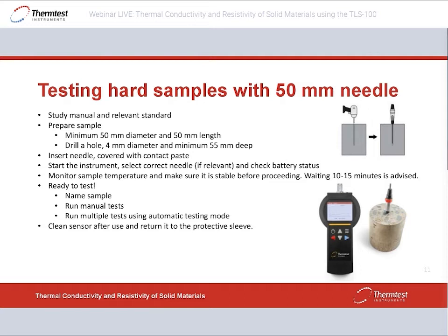We need to drill in the center because we want the same distance to the outer boundaries from the needle at all times. The hole should be at least 55 millimeters deep. So this is, as you see, a little bit more than the 50 millimeter minimum length. Often the samples are probably larger than 50 millimeter long.